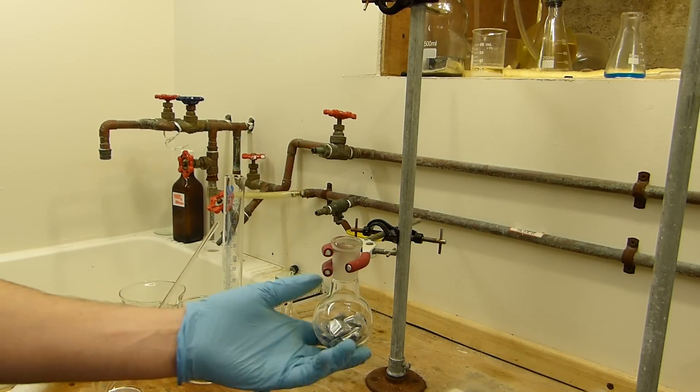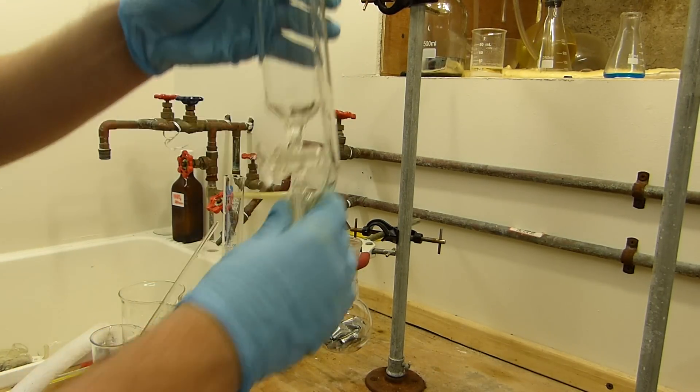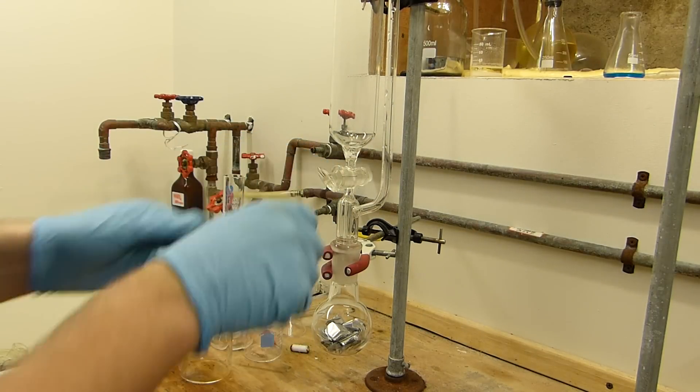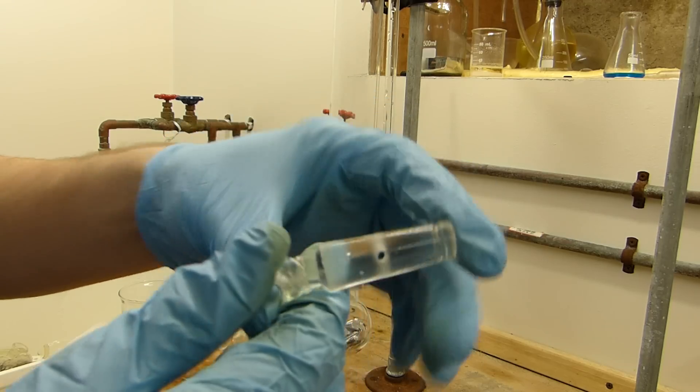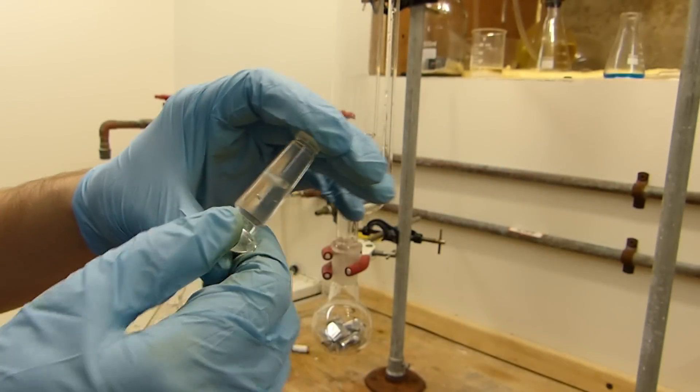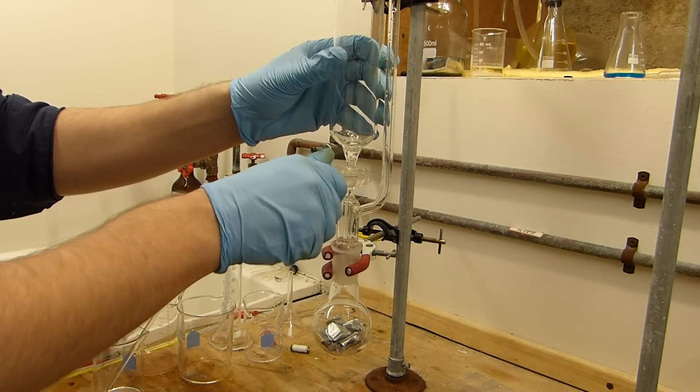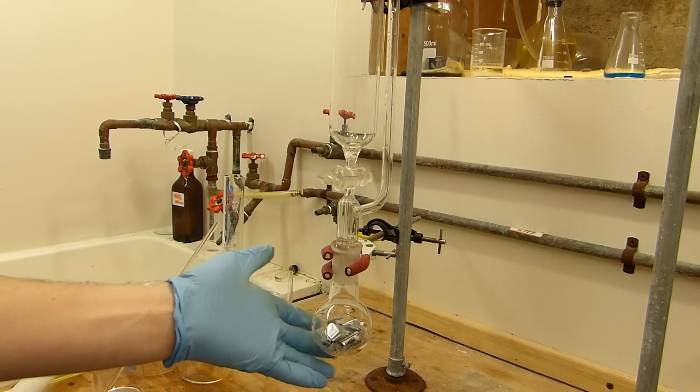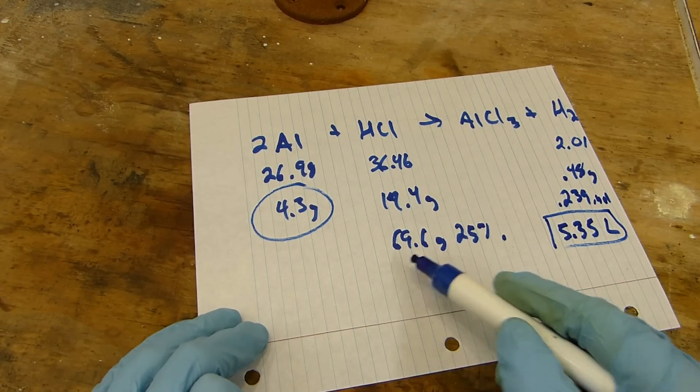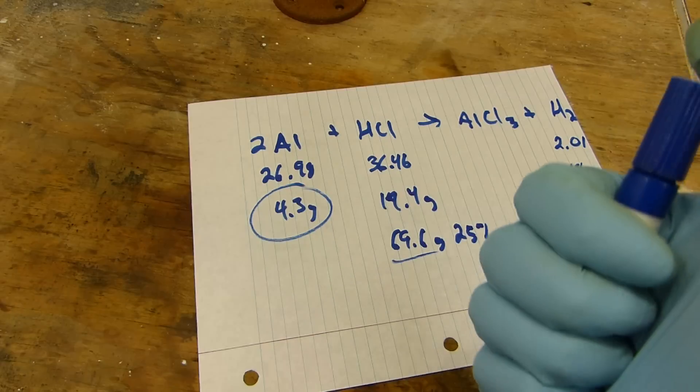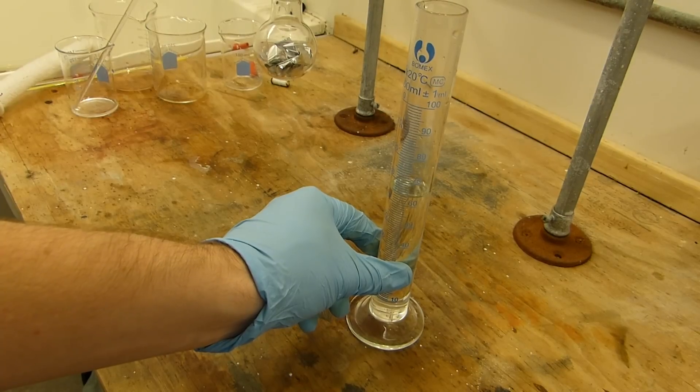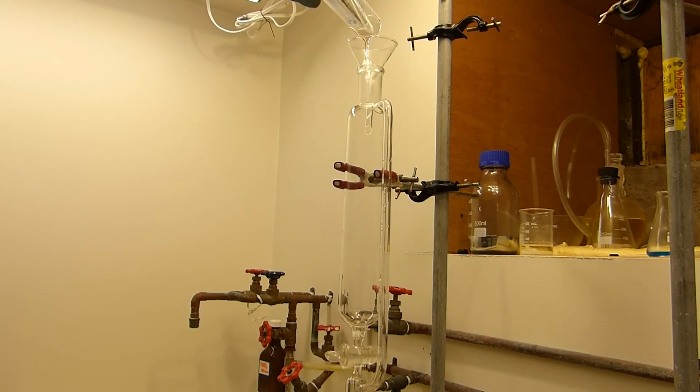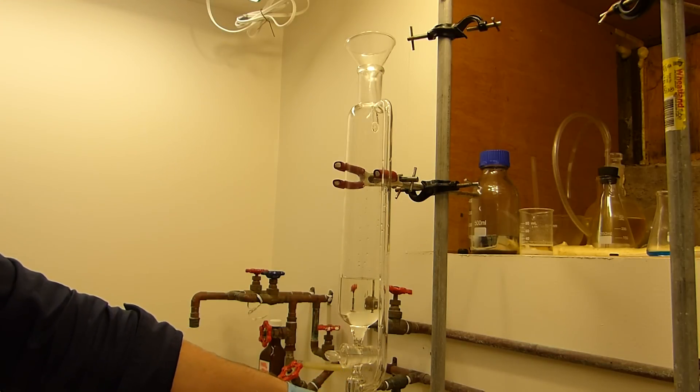I'll then set up the hydrogen generator which simply consists of the flask of aluminum and a pressure equalizing addition funnel. This is a 250, it's the smallest I have, so it'll have to do. This will contain the hydrochloric acid that we'll be using to drip onto the foil. Now make sure your stopcock is well greased, but here's another tip: when you're greasing the stopcock make sure that the hole is clear because sometimes if that fills with grease you'll have problems. To react the full 4.3 grams of aluminum we're going to need 69.6 grams of 29% HCl. Let me load it into the pressure equalizing funnel here.